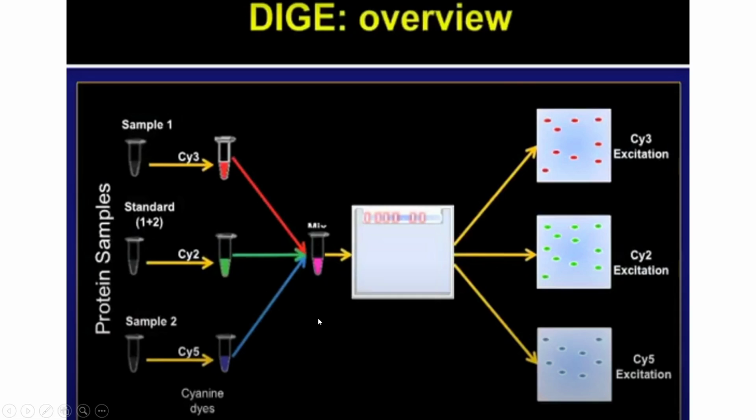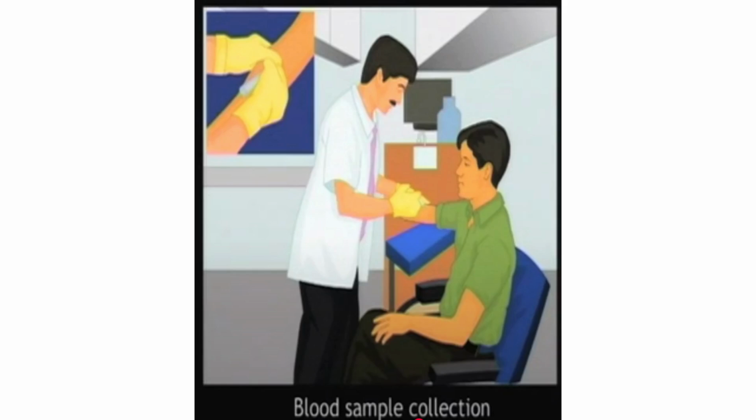He tried to give you an example, and in that specific second lecture, sir majorly talked about how to do those analyses by clicking. It is easy to use specific software. You can all go through that specific video in order to understand how exactly the software can be used once you get the image using the Typhoon scanner.